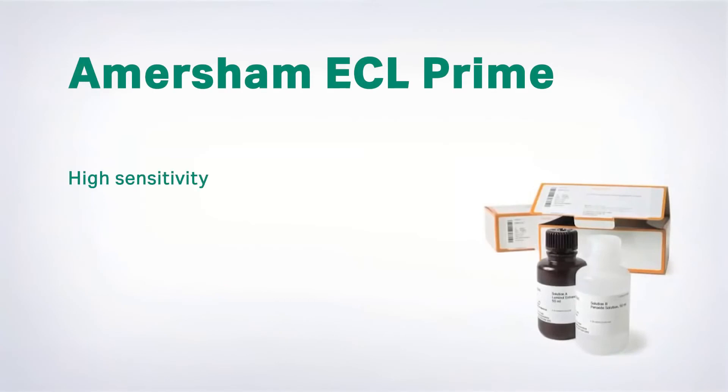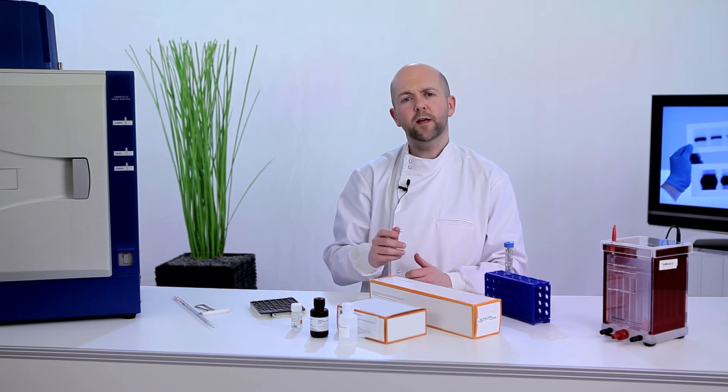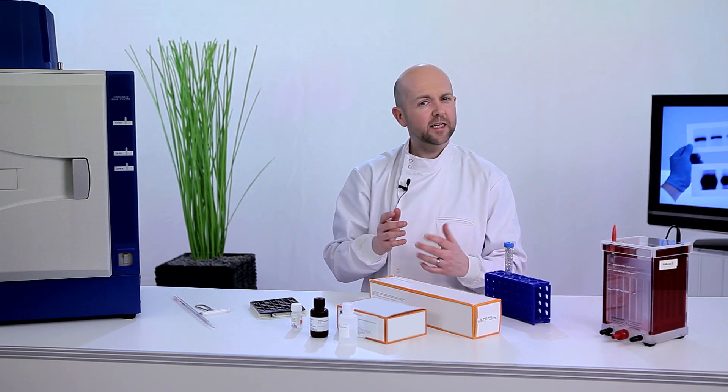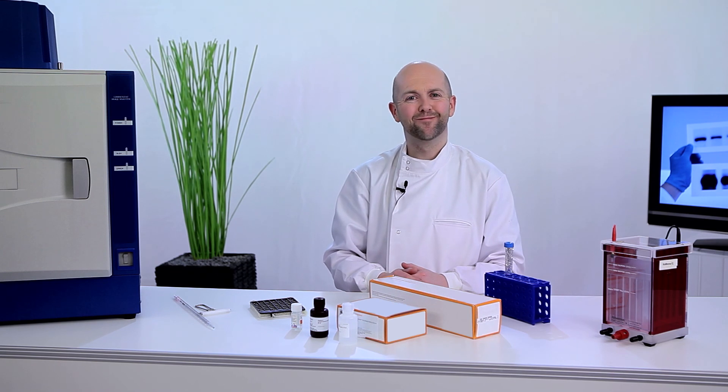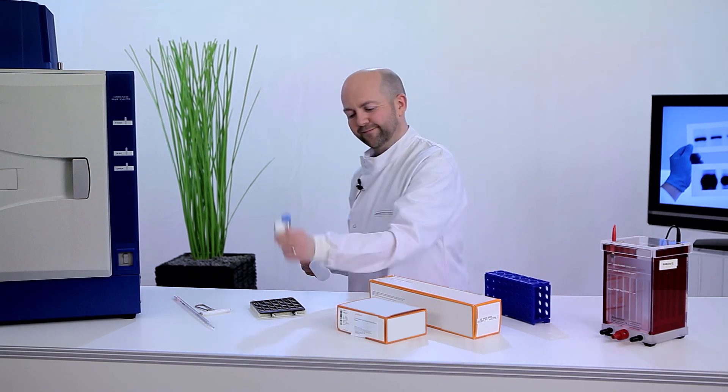High sensitivity, broad dynamic range, and long-lasting stable signals. Continue doing exactly as you do now and benefit from the real ECL heritage from which ECL prime was developed. If you follow the tips and tricks in this step-by-step video, ECL prime will give you results to dream about.